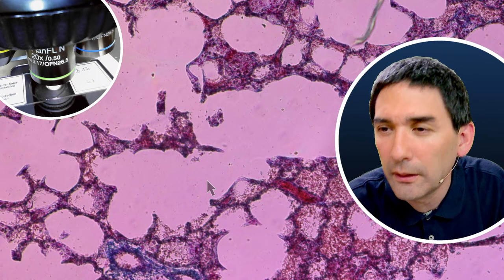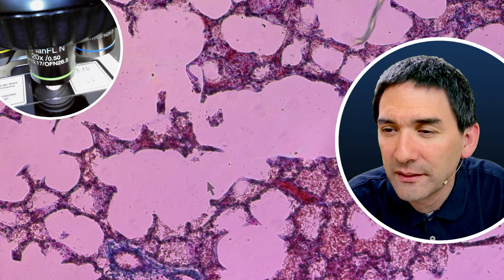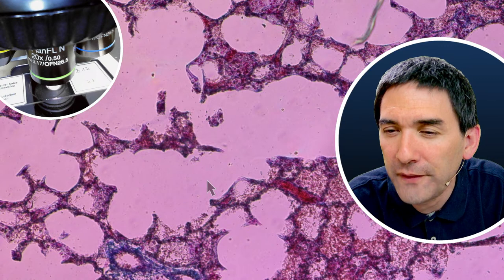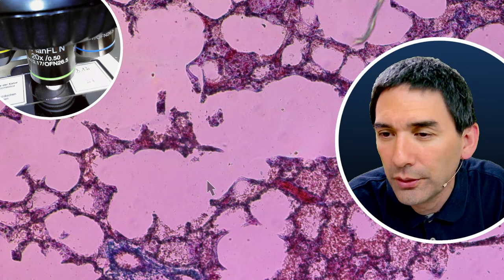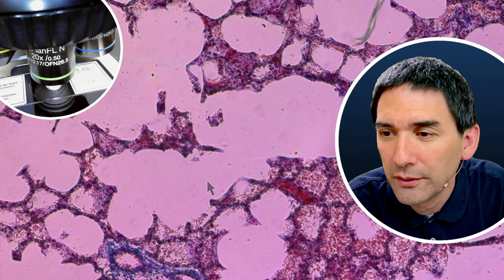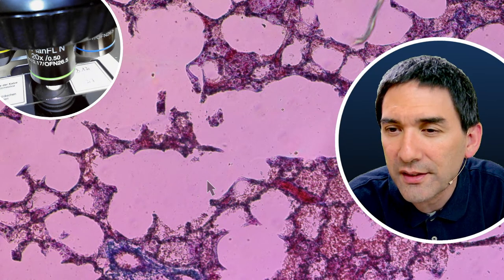That looks like normal lung tissue. Again, this is from a cat. Yeah, I got a cheap microscope for $50 and it was able to view bacteria at 1600 magnification with high image quality. That's pretty good, if you got a cheap one. The bacteria are generally difficult to observe because they have a low contrast.